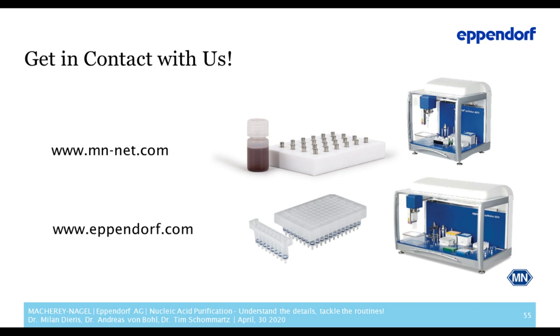And I think I have to add here at that point that very large automation solutions often have or can have a built-in centrifuge, but then we are talking really about usually a very big system.